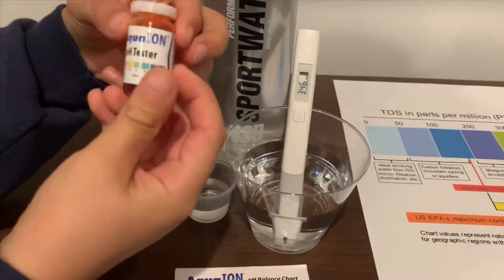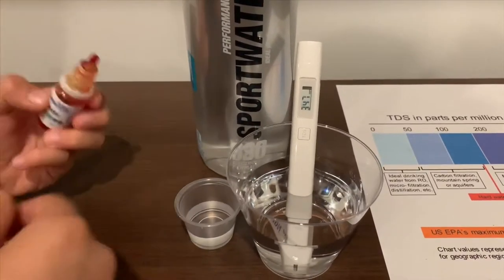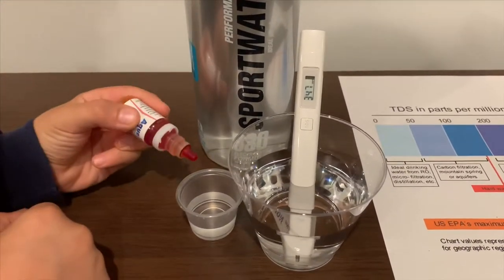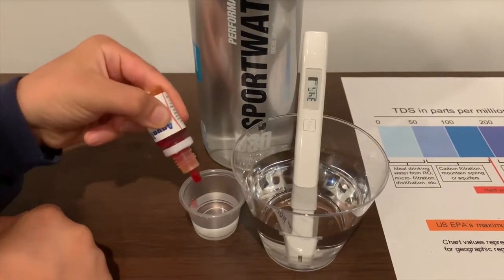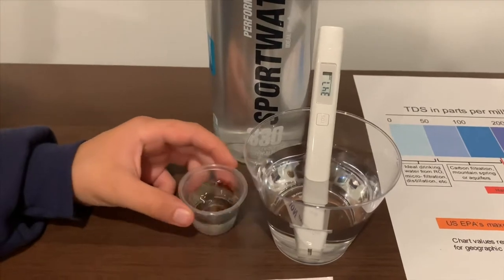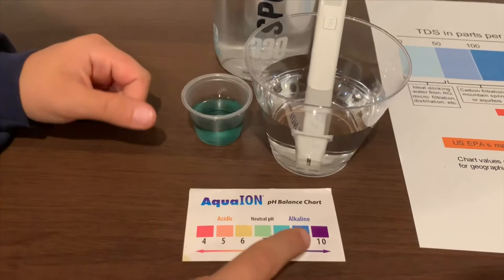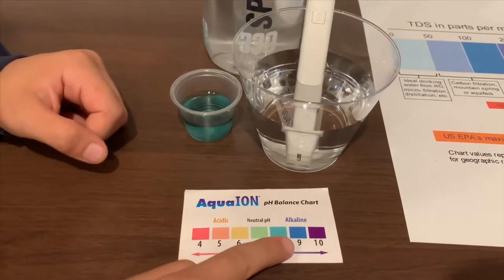Now, if you want to buy this pH tester, check the link down below. Let's test the pH. Let me do two drops. I give this a 9 — that means this is alkaline water.